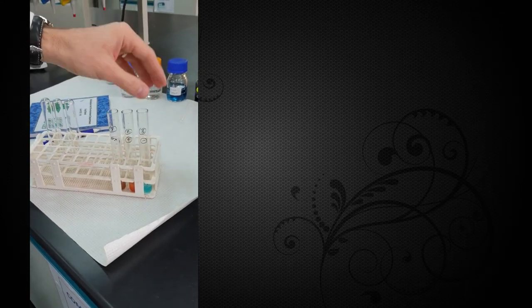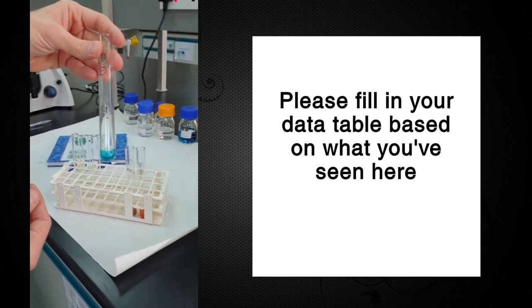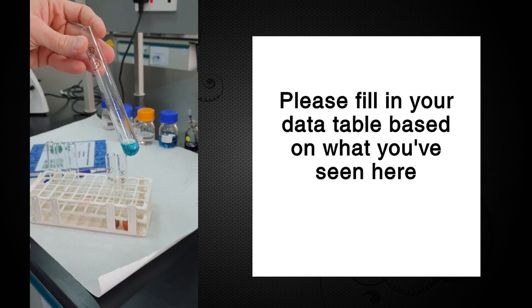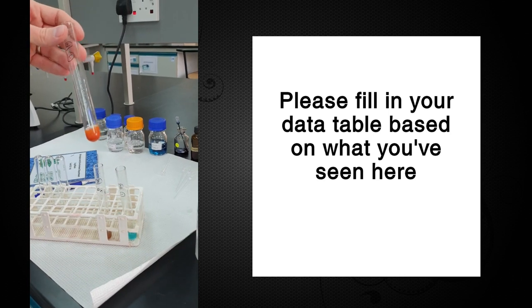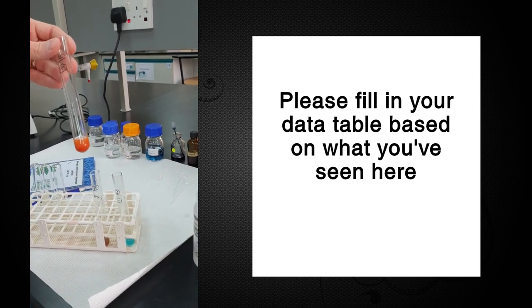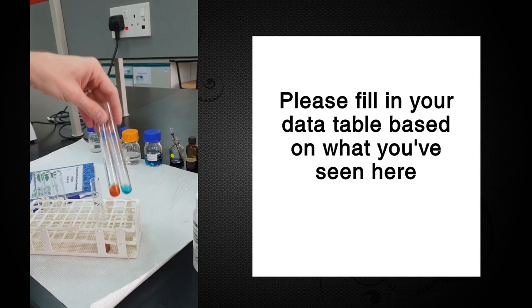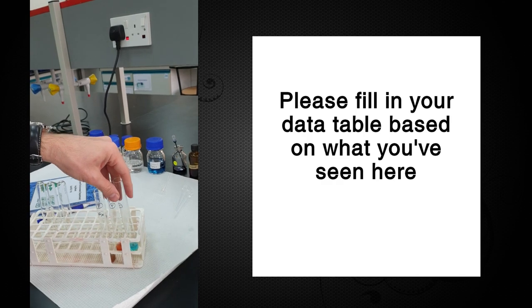Our results from our experiment. Let's take a look at the negative control first. The negative control shows us what it looks like when we don't have any glucose. We don't have any reducing sugars in this solution, and so we have a nice blue solution here. Now our positive control, again, this is from inside the dialysis bag. We know we put glucose in there, and clearly there is glucose there. You can clearly see there's a big difference between these two tubes. We obviously have a lot of precipitate here that's nice and red.